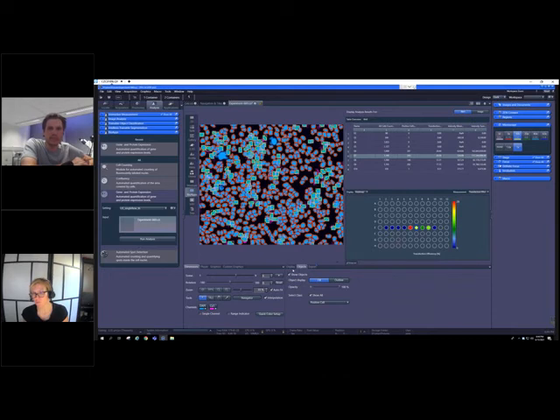The confluency bio app is set up for contrast images. We have the gene and protein expression bio app. This is the one you have seen, where we have two different layers of segmentation. The requirement for that would be basically 2 channels to run an analysis. In the background, it's based on an analysis feature which we introduced some 2 years ago, called zone of influence. This is what you see here around our nuclei, the red rings.